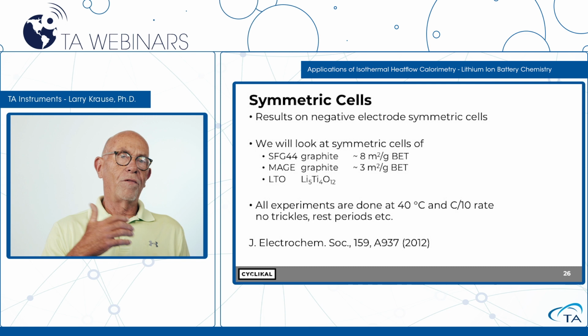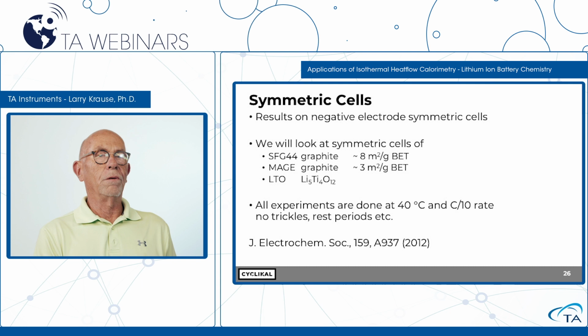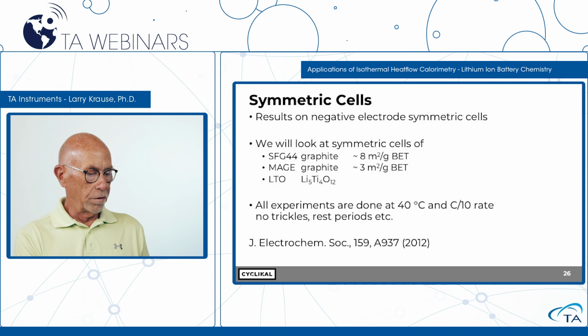So it becomes a question. You employ lithium-ion batteries because of their energy density, and when you go to a very stable negative electrode like a titanate, you lose a lot of energy density. But it's an interesting electrode just for the exercise of seeing how that reacts with electrolytes in a calorimeter measurement. So all these experiments are done at 40C at a C over 10 rate. There's no trickles and no rest periods. And here's a reference where that work appears.